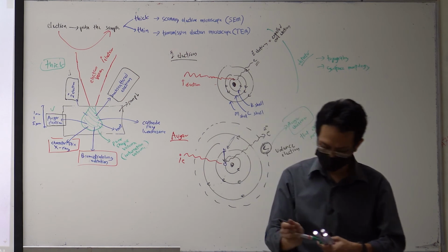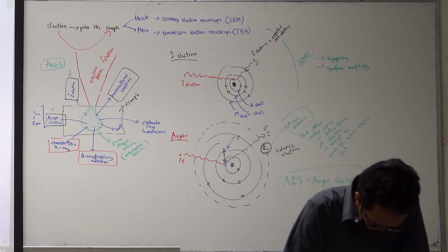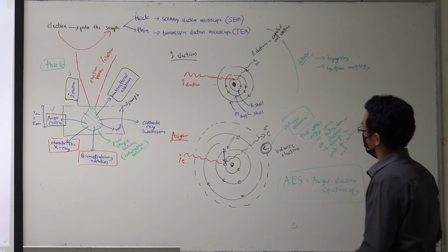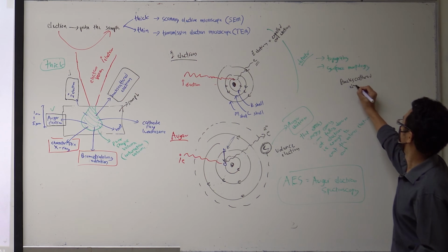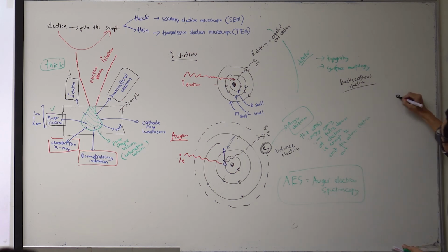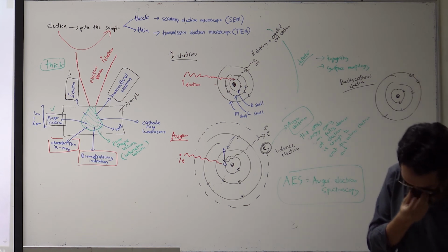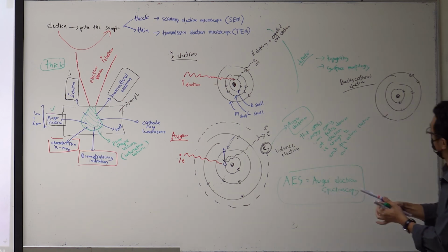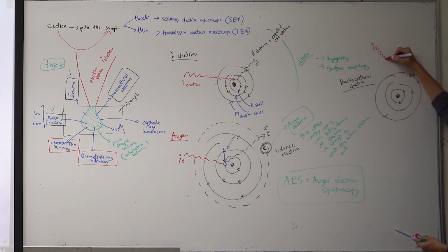Now the backscattered electron. Same idea, not quite the same idea, but with the same picture, and then you have electrons. You see this first electron. So you have the primary electron coming here, and then it just scatters like that.